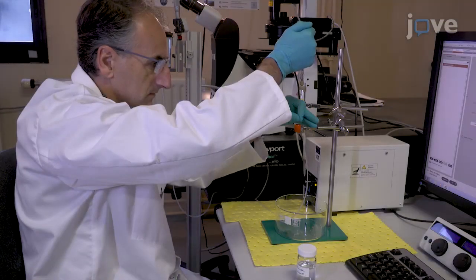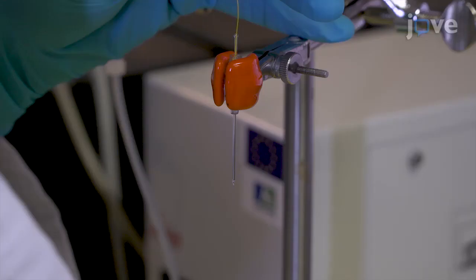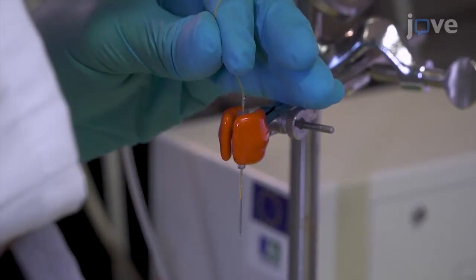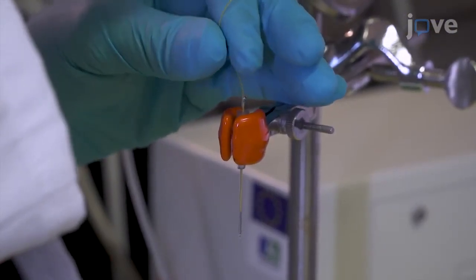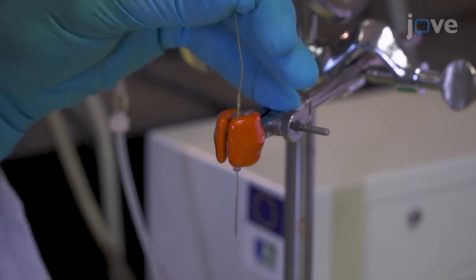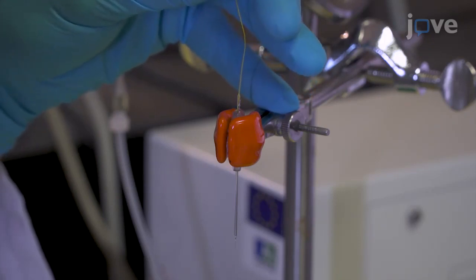Using a 500 microliter glass syringe equipped with a flexible fused silica capillary, fill each pipette with the glucose solution. Then aspirate the solution from each pipette before refilling the pipettes with fresh glucose solution several times until all of the serum has been removed.